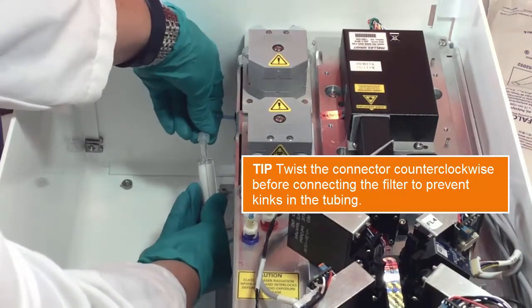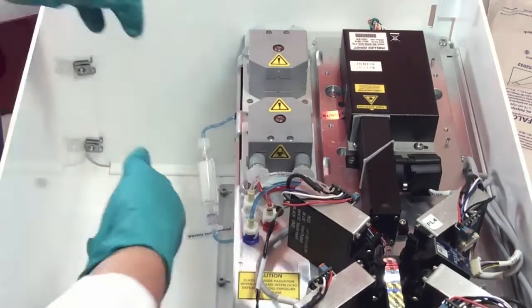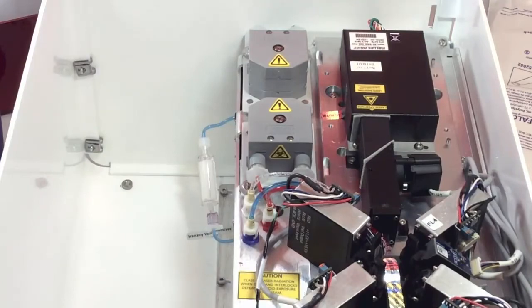Also, when you restart the instrument after completing the preventative maintenance, it will take a little longer to complete the startup process because the system will be wetting this filter.